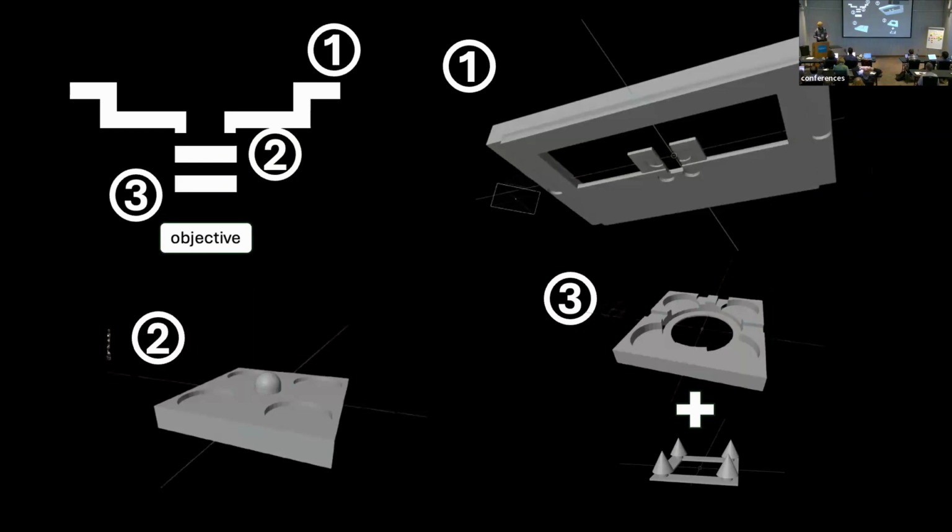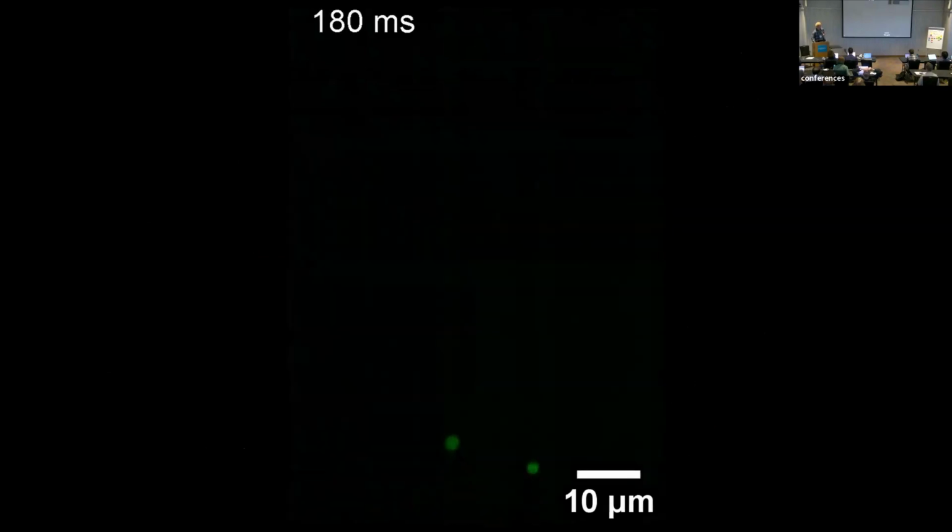And so what are the results? One of the coolest videos that I managed to record is a neutrophil inside a blood vessel of the intestine, which looks like it's walking. So this is definitely one of the coolest things. Apart from it, when I was playing with GFP tagged mice, GFP was tagged to some junctional protein.